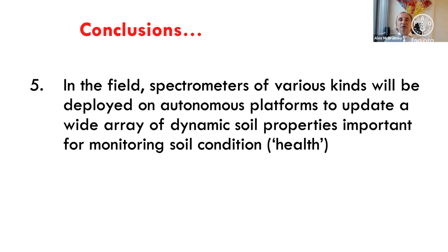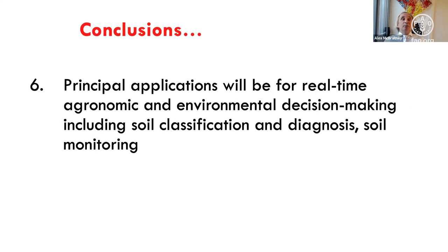In the field, spectrometers of various kinds will be deployed on autonomous platforms to update a wide array of dynamic soil properties important for monitoring soil condition or health to help us better manage soil. Next slide. Principal applications will be for real-time agronomic and environmental decision-making, but also including soil classification and diagnosis and soil monitoring. That's the end of the conclusions. Go to the next slide, please.